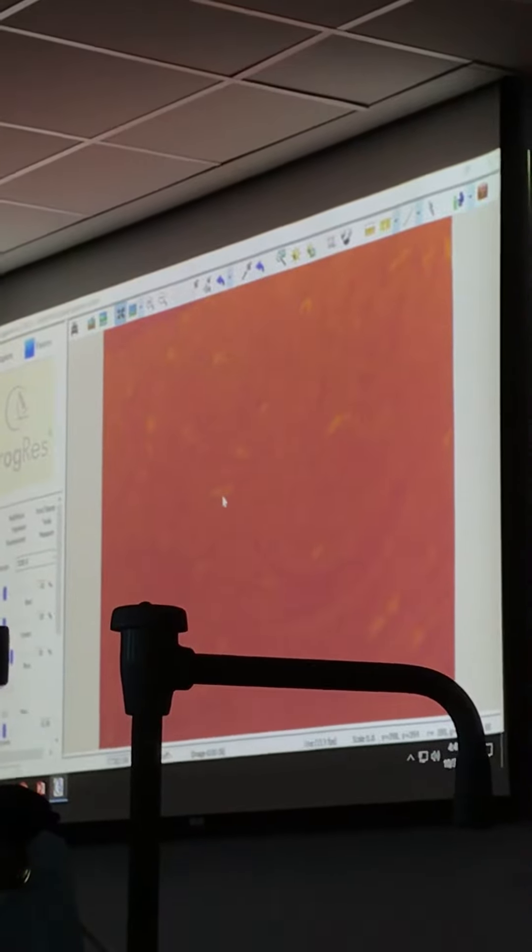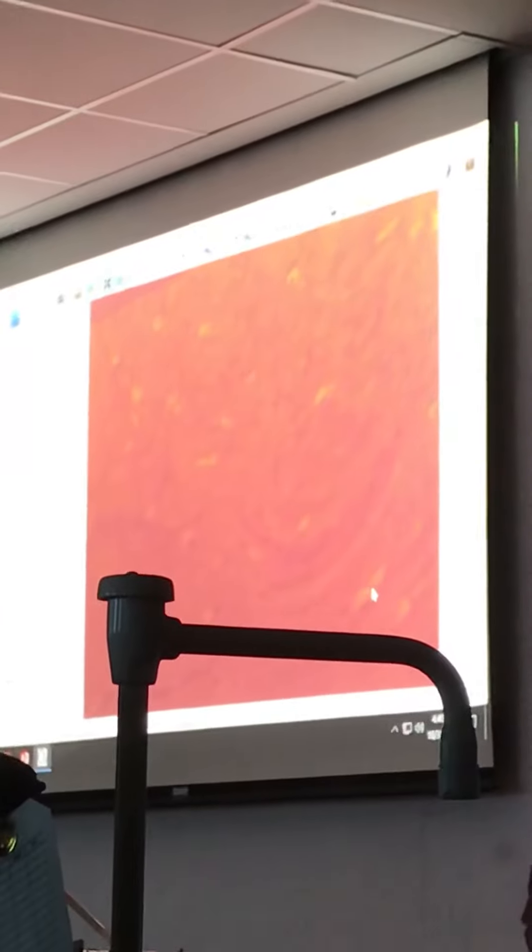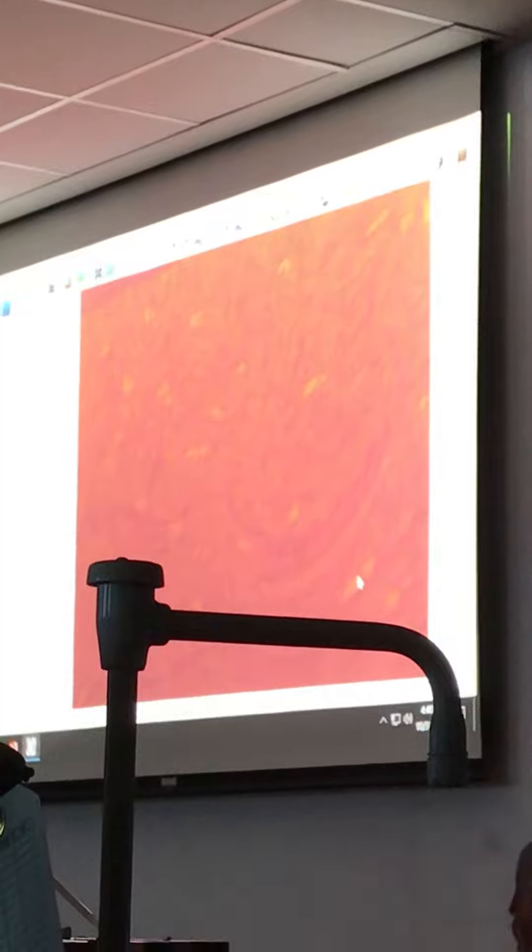This is one node of Ranvier that you can see distinctly. You can see another node of Ranvier right here, but again you see the myelin sheath kind of coming together, bunching up right here.